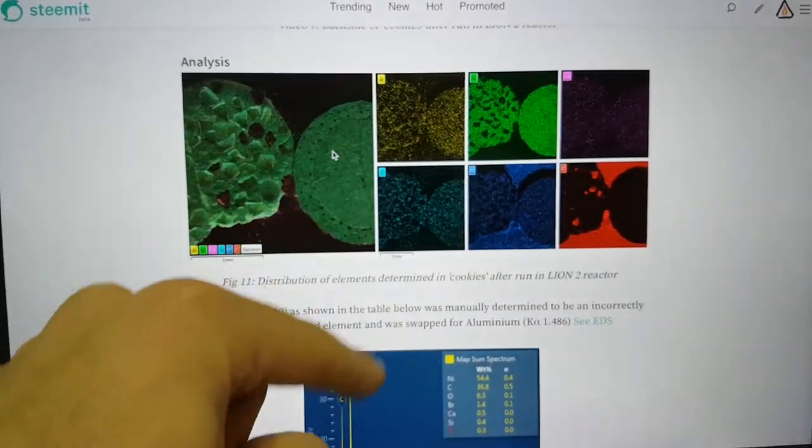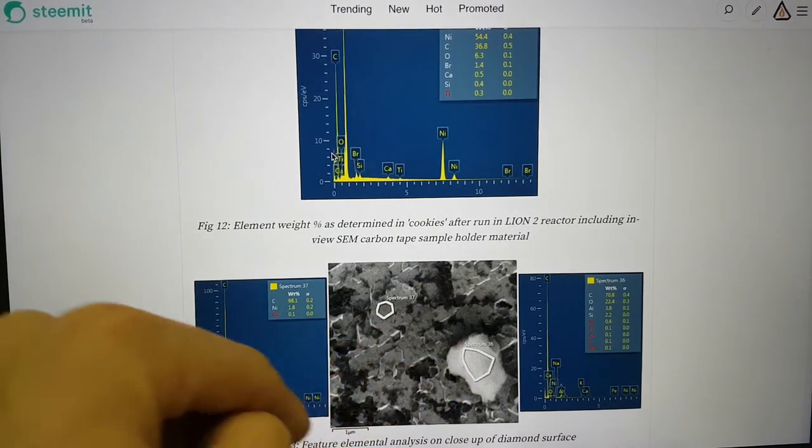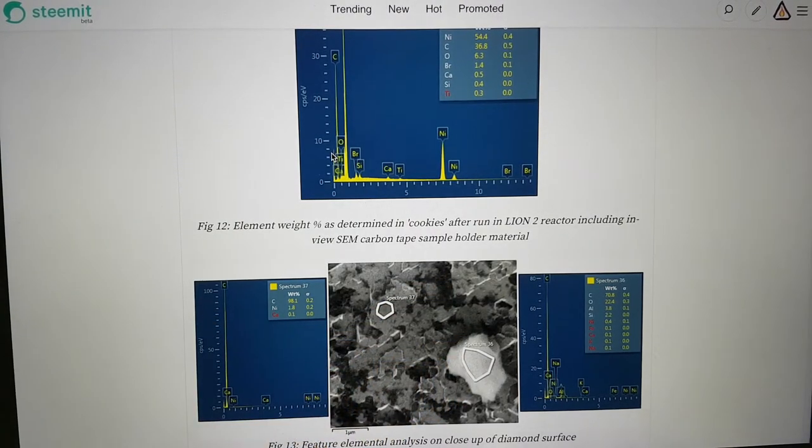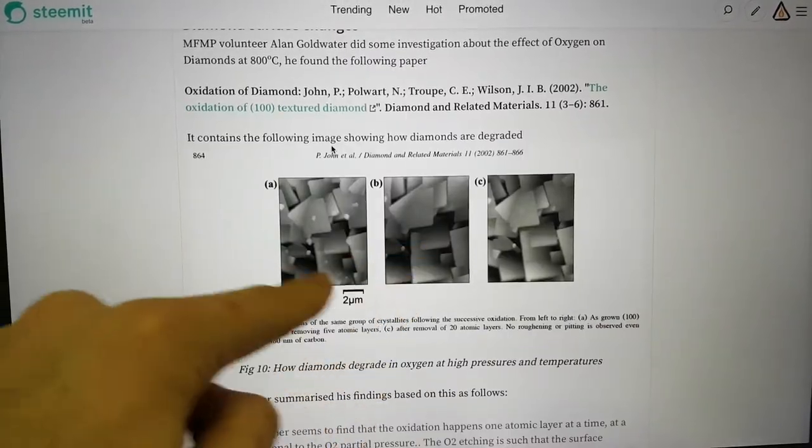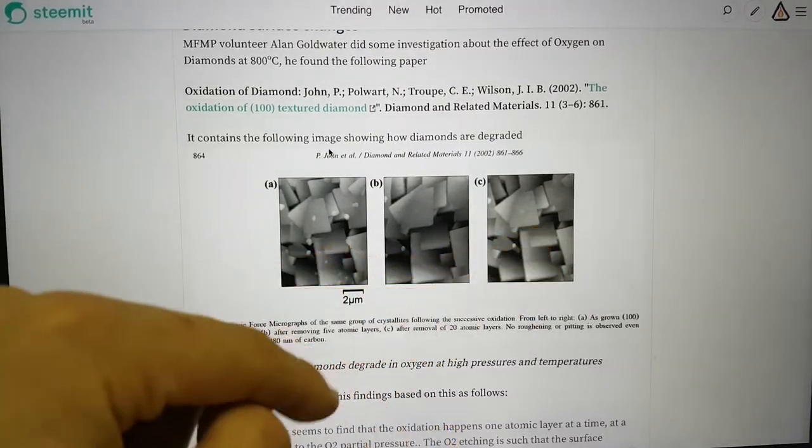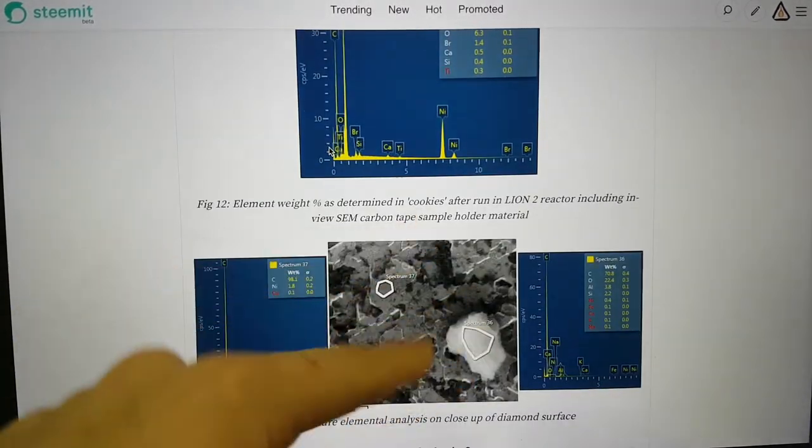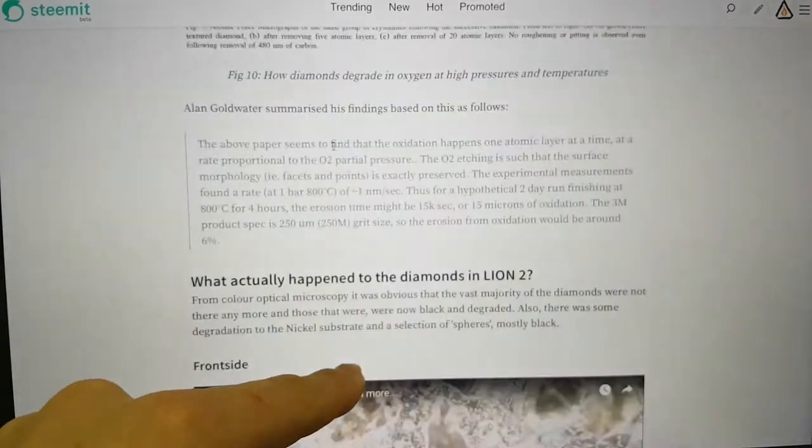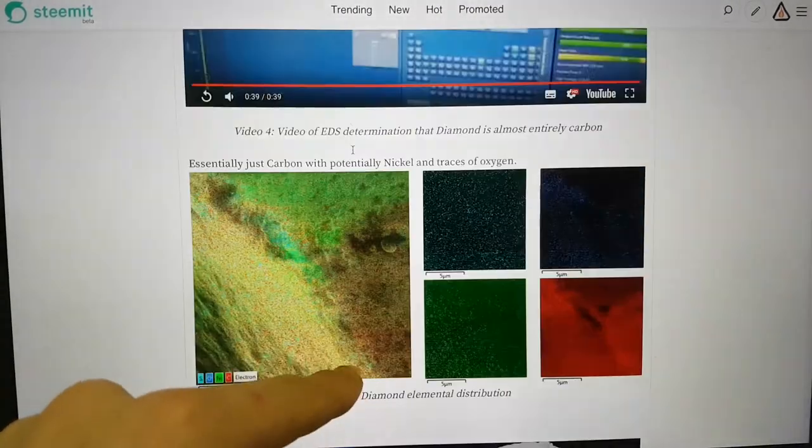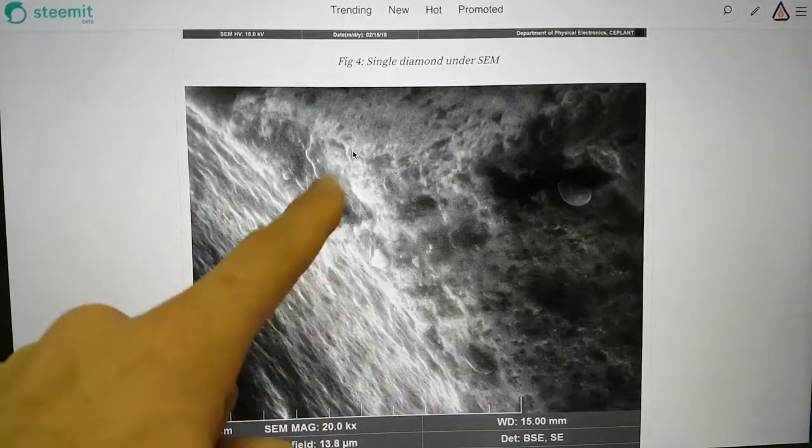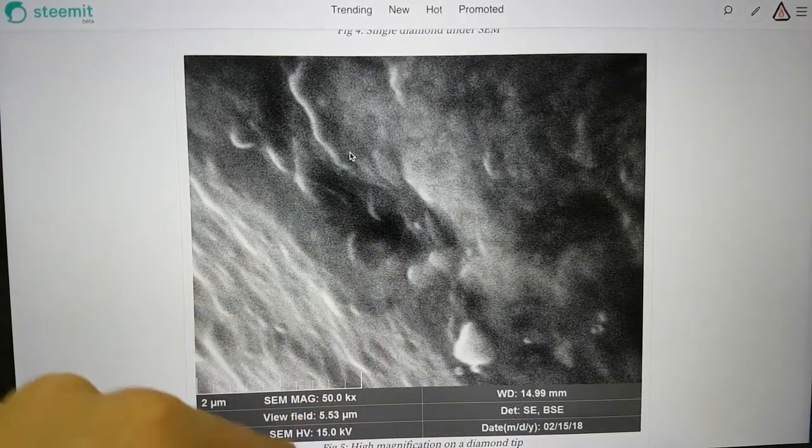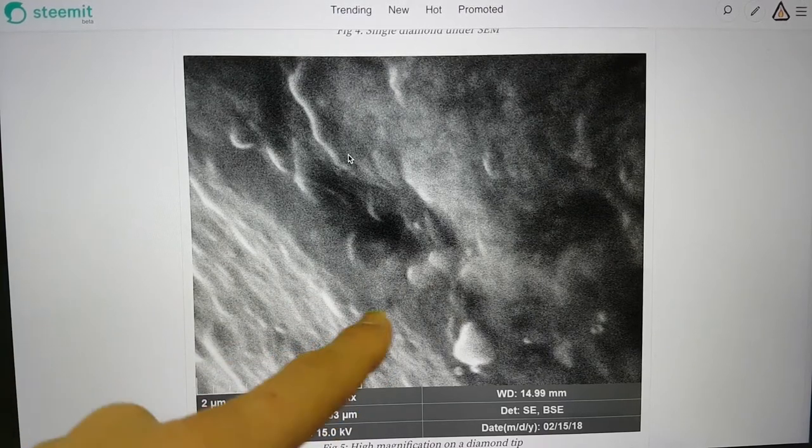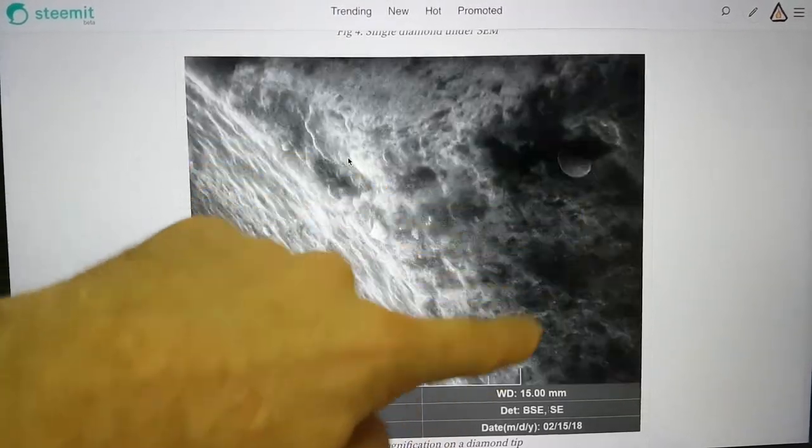This area had aluminum and silicon and some carbon and oxygen and other elements that were not to be determined. It's a shame because we had little time and we need to go back and have another look at this. There are other darker areas and features we didn't delve into on the analysis. You can already immediately see that this does not look a lot like this. It hasn't just lost mass, it's kind of been tuned up.